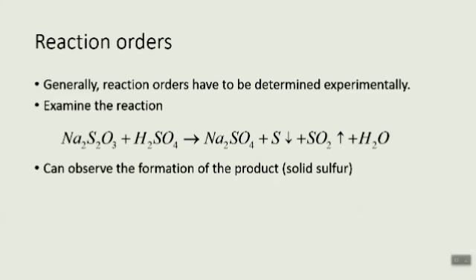So in this experiment, we will examine the decomposition reaction of sodium thiosulfate in acidic environment. We choose this reaction because the product is solid sulfur, and we can observe the formation of the product, so we can measure the rate of this reaction.